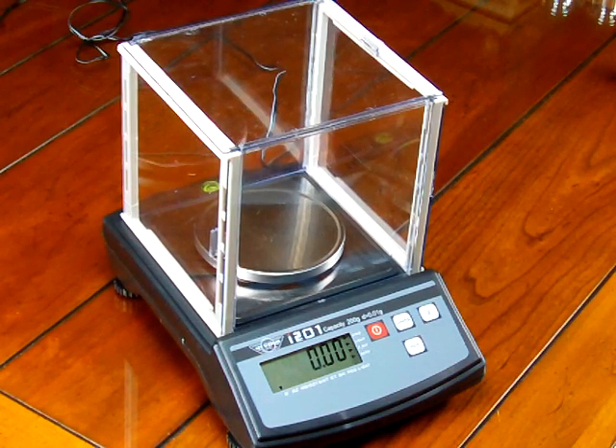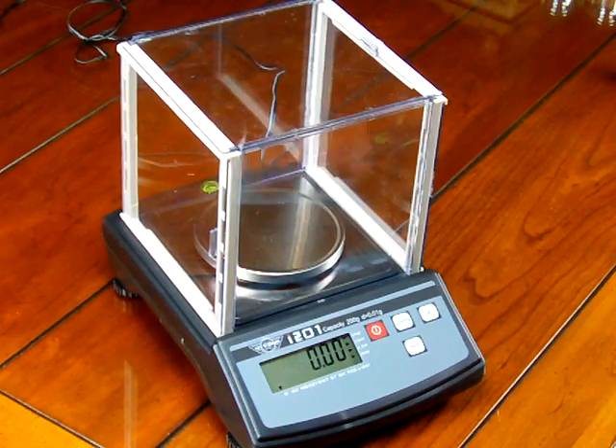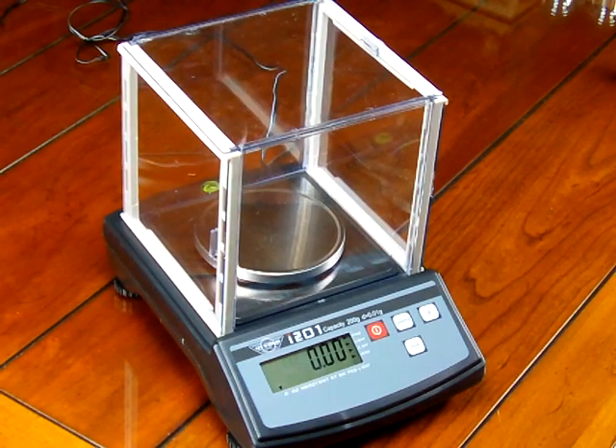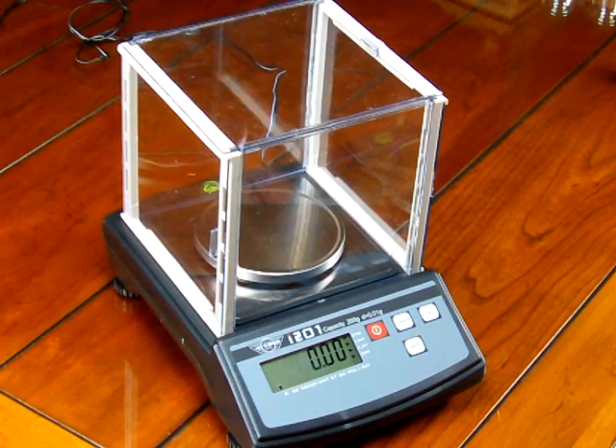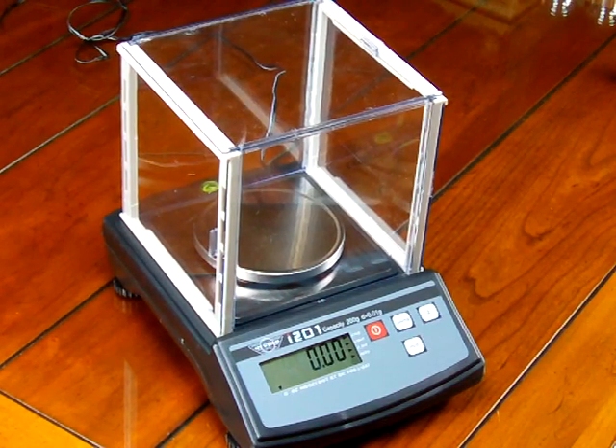In this video, we'll be demonstrating the MyWay i201 digital scale. This scale has a weighing capacity of 200 grams in increments of 0.01 gram divisions, which is equivalent to 10 milligram divisions.